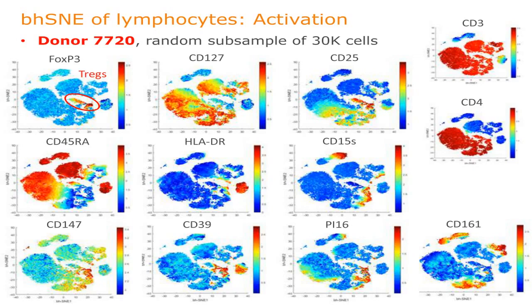I could say some of them are probably B cells, some of them are probably the non-CD3 expressing cells. They could be my NK cells or my innate cells, my dendritic cells. But I don't know because I don't have markers to define them. All I know is they're placed in a cluster somewhere else that's blue, for example.